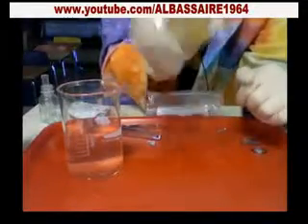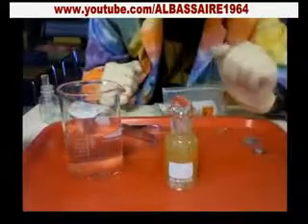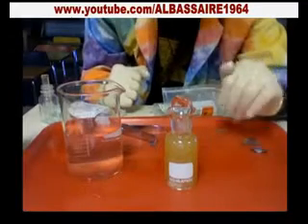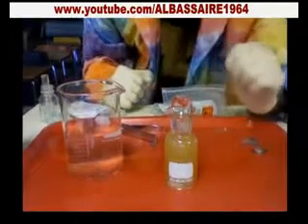If I start to see a brownish color, and you can see that as well, that means that there's oxygen in the water. I'm going to shake it vigorously, and the precipitate is starting to form. Then I'm just going to let it set for a second. When you let it set, you want to make sure that the flocculant, which is this solid material, sinks to the bottom. So I'm going to let it sit like that.